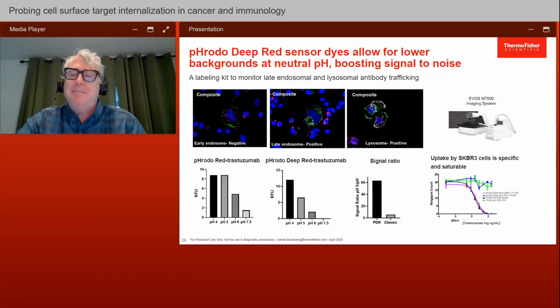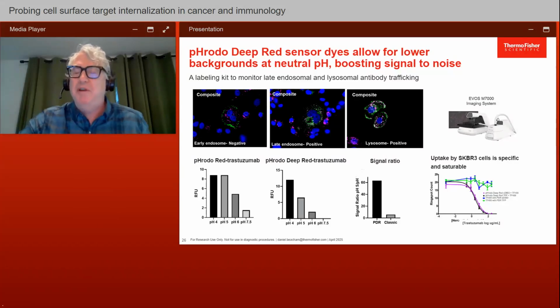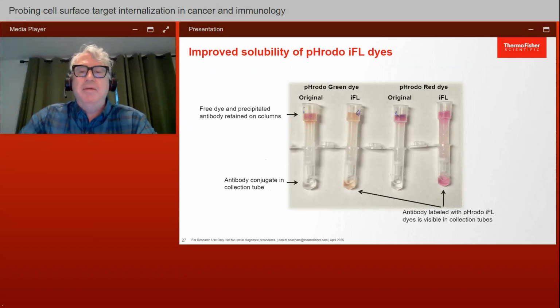And so this is not something people often do, but it's something you can do, and I encourage it if you have doubts about the non-specific amine labeling of your therapeutic or other antibody in your probes, because many times people want to direct the label to a different part of the antibody. A lot of data in this slide.